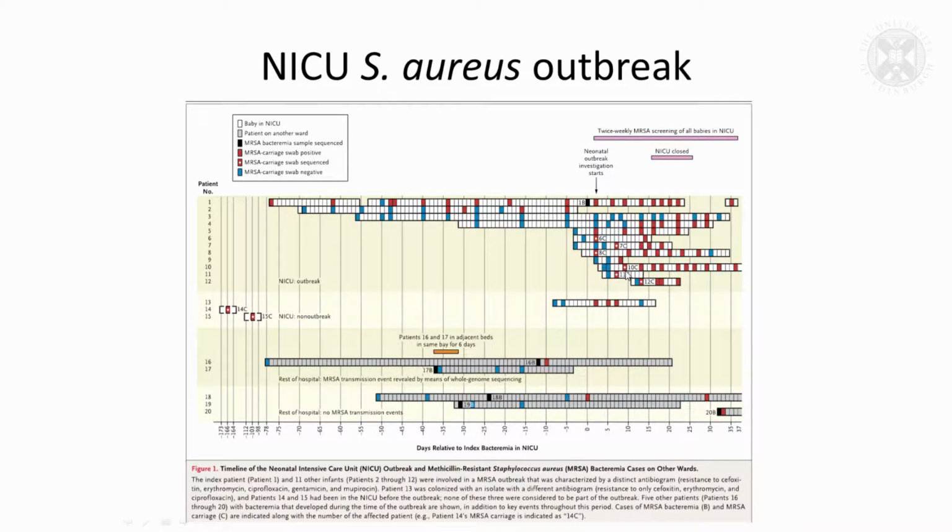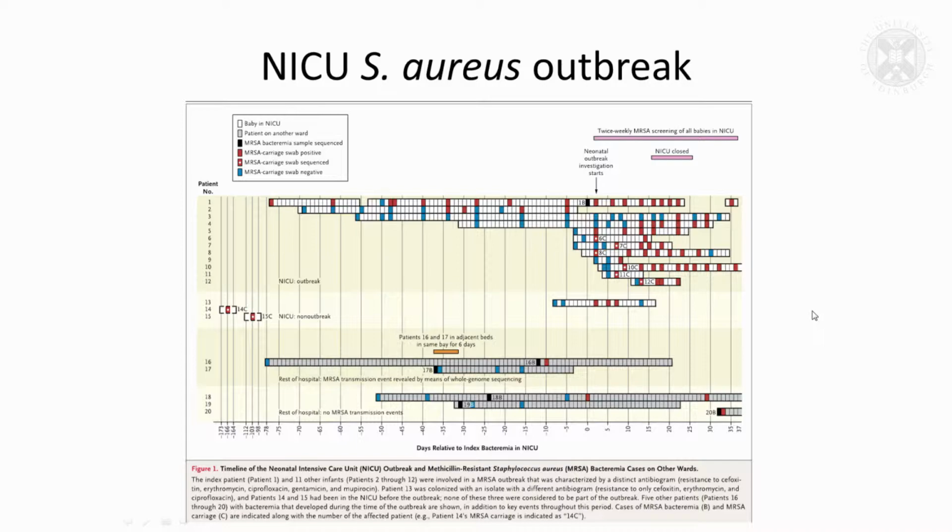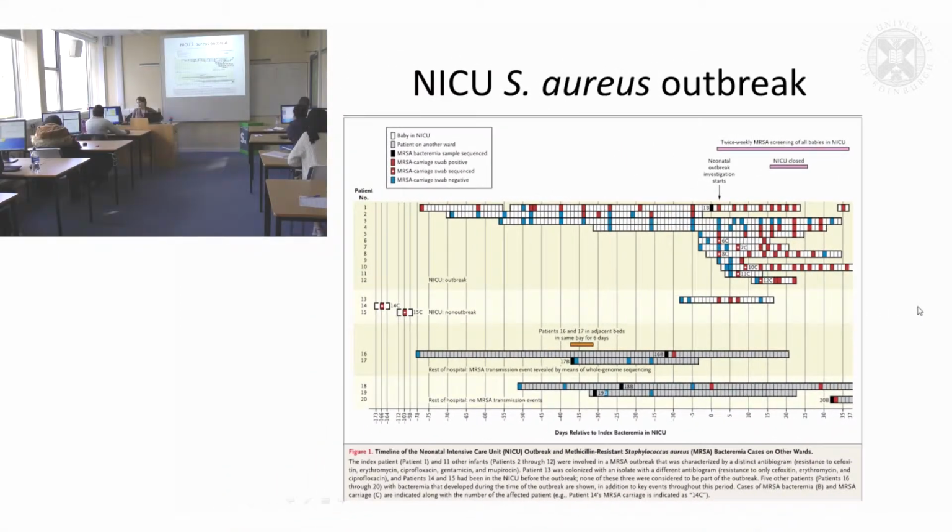And your suggestion for time is very good, but it was taken the same time as some of the other strains. So it doesn't seem to be any earlier. And in fact, these ones were sequenced as well in there. Well, they're over there somewhere. Yeah, so it's not that.